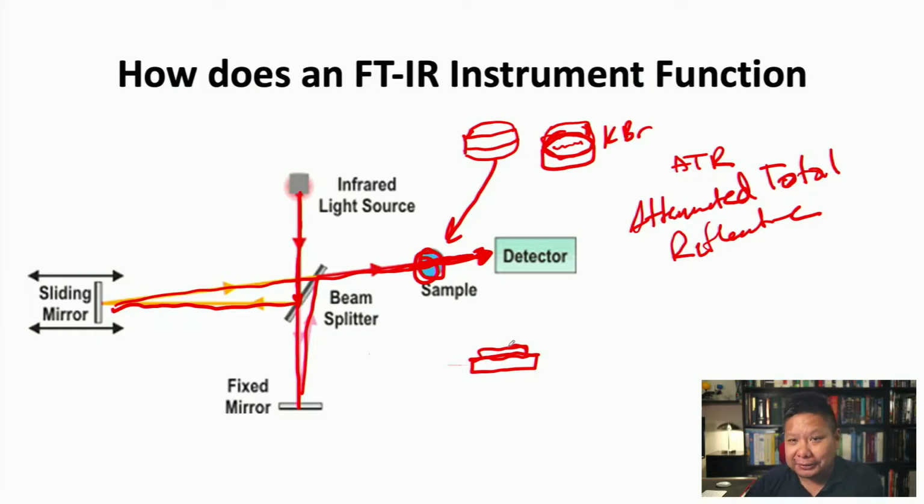If you know, post it in the comments below, if you're watching on YouTube. So the sample sits up there, and it could be a liquid sample or a solid sample. That was one of the advantages of using the ATR, because the ATR had this thing at the top that was like an anvil, like a hammer thing, right? It looked like a microscope even, sort of. You would twist this knob on the side, and it would crush the sample into the crystal.